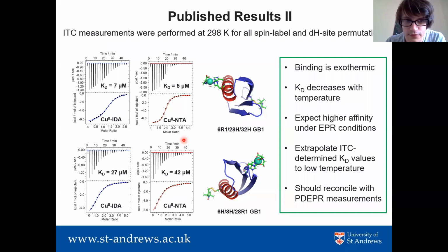Or you have something else which could bind, even with lower affinity, and might be in excess. If at room temperature you have a dynamic balance, that was the core of my question. What obstacles might you see due to this dynamic balance at ambient temperature before you cool down?